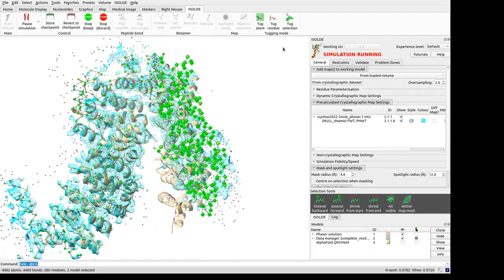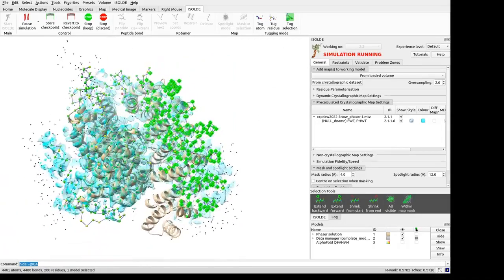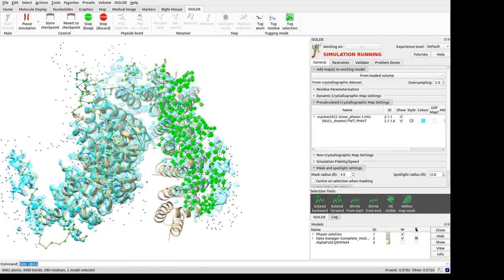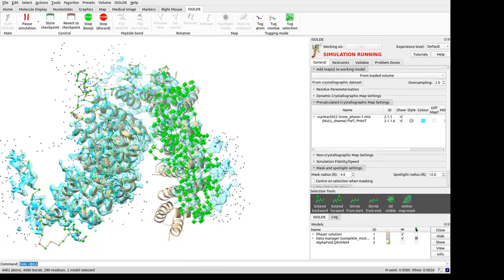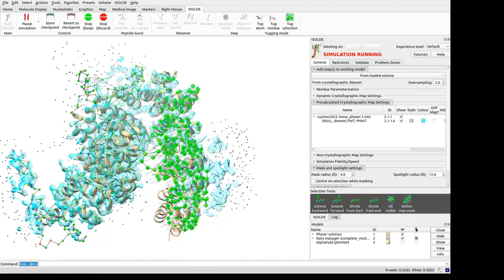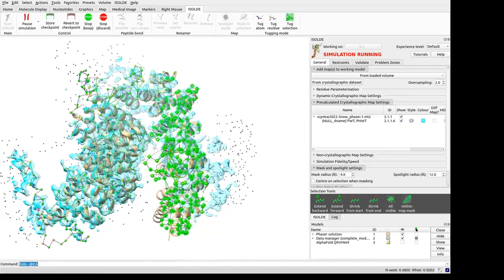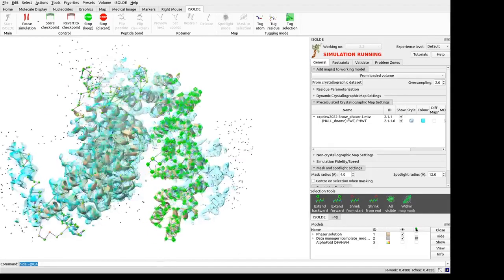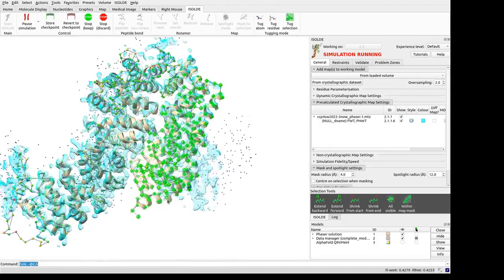Here the C-terminal domain is already well fitted, but the N-terminus is way out, so we select the first few hundred residues to tug into place. Notice that rather than pulling continuously, I tug in short bursts, allowing the model a chance to settle locally in between. Once the model atoms come within the radius of convergence of the target density, they settle obviously into concordance with the MR solution. At this point, we can stop the current running simulation.